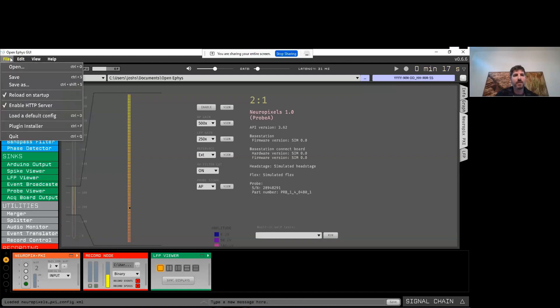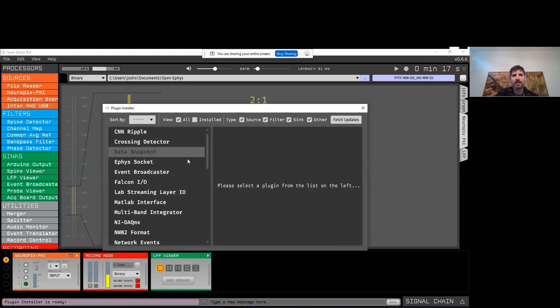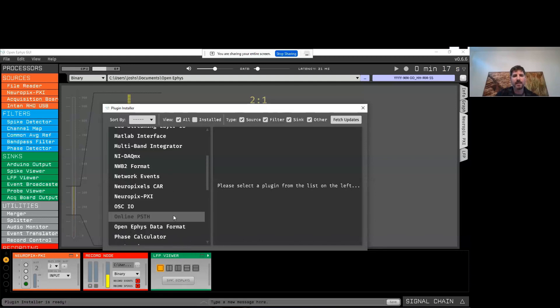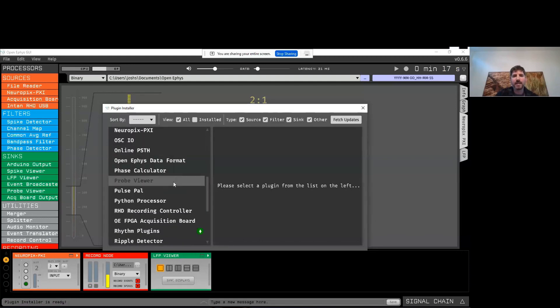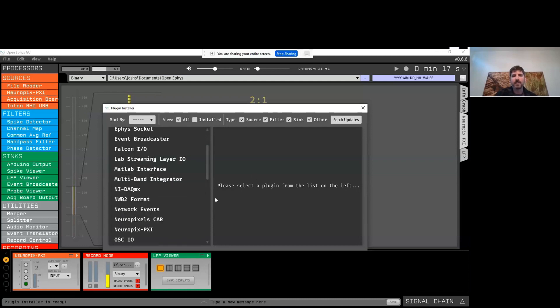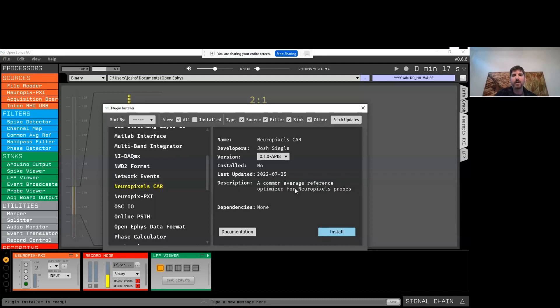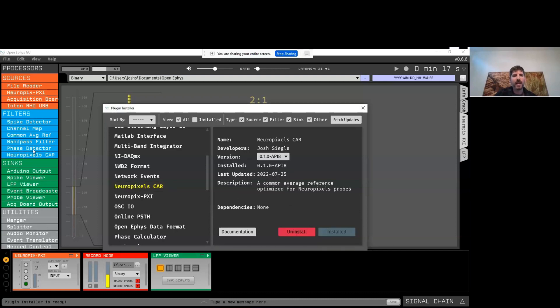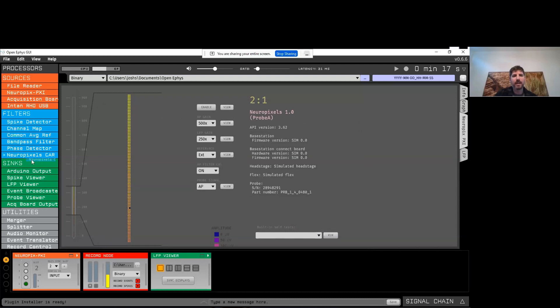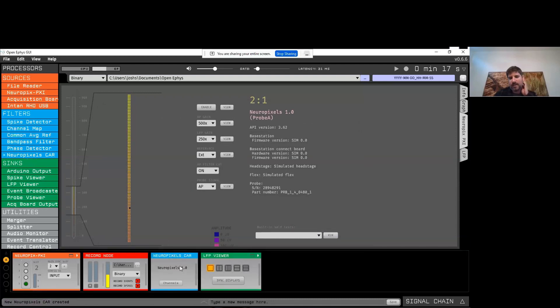Now I want to show the plugin installer. If you go to File > Plugin Installer, you get a list of all the plugins available to download and extend the functionality of the software. There are links to documentation for all of these. We're going to select one specific to Neuropixels called the Neuropixels common average reference, or Neuropixels CAR. Installing it adds it to our processor list, and we can drag and drop it into the signal chain. This plugin performs common average referencing but takes into account which channels on the Neuropixels probe are simultaneously sampled, doing a better job of removing noise than a standard common average reference.